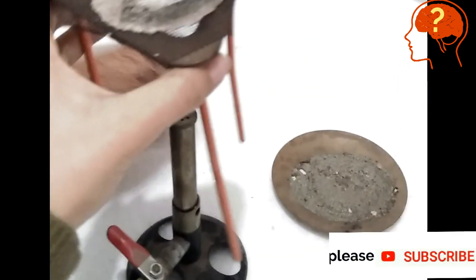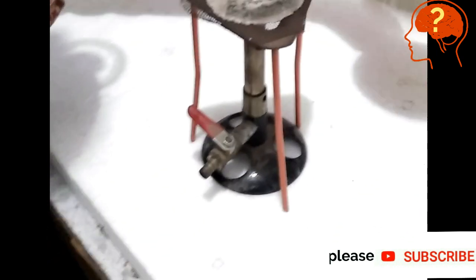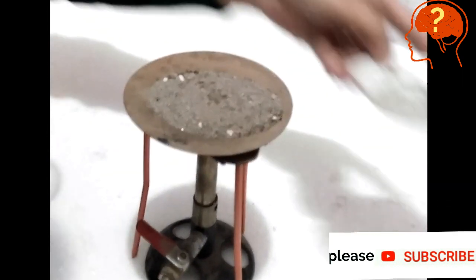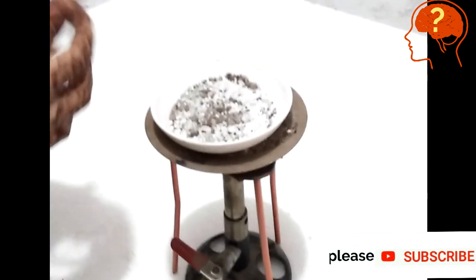Now set the apparatus, place the bunsen burner, then tripod stand, then sand bath, then china dish having mixture.